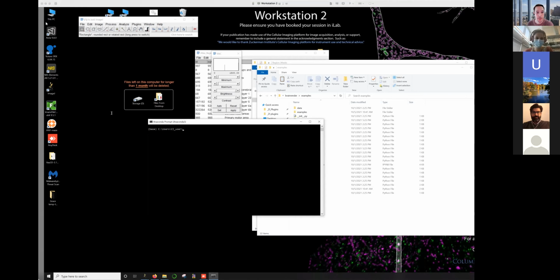So the way you can do this is you type in conda create to create a new environment, and we can give it a name by saying -n, and then we should name it something. So I'm just going to call this BrainRender tutorial. If you do this, it's just going to create an environment with the default version of Python. BrainRender only works with some specific versions of Python, so we can tell it that we want to use a specific version. In our case, we want to use 3.7. And if I enter, this should now create a fresh environment with Python 3.7.